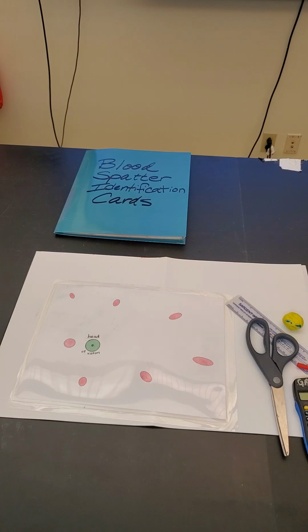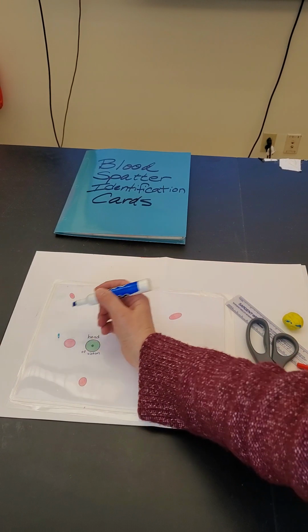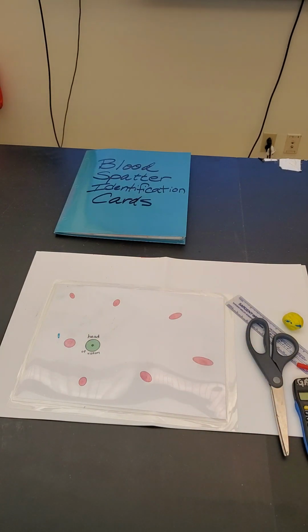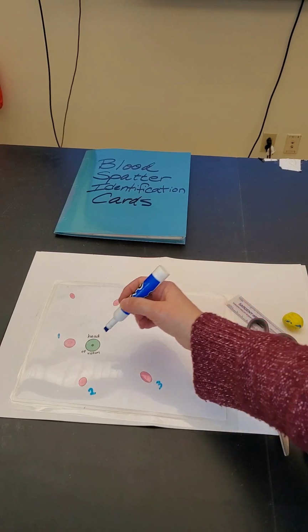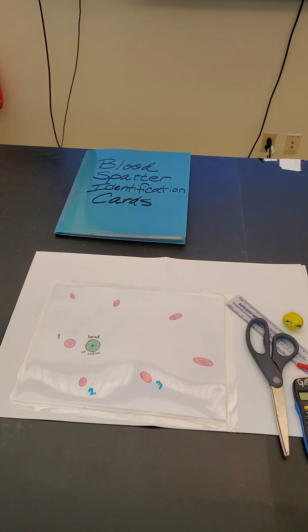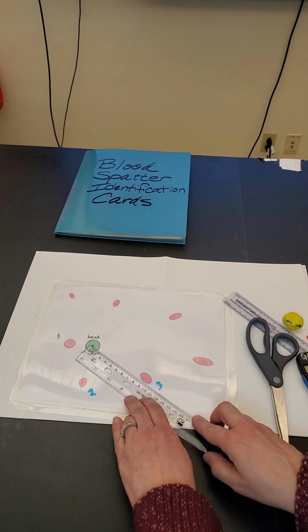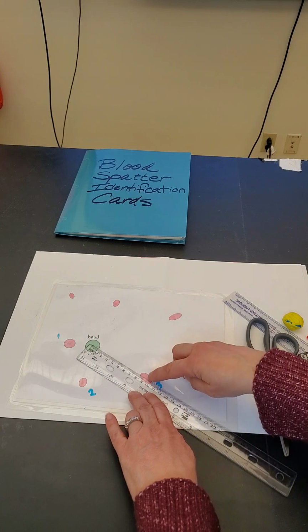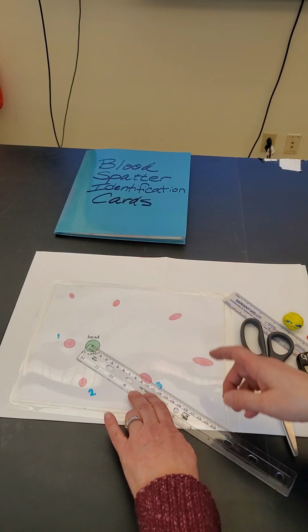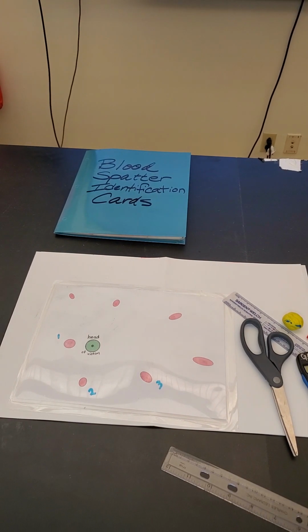I can also mark them to help me remember which one is which. This is going to be number 1. Okay, then I can do number 2, number 3, and I can put what's the distance between the center of the drop to the center of the victim's head. So center of the drop, center of the victim's head, that's about 9.3-ish. So let's say that number 3, 9.3, we put that on our sheet.